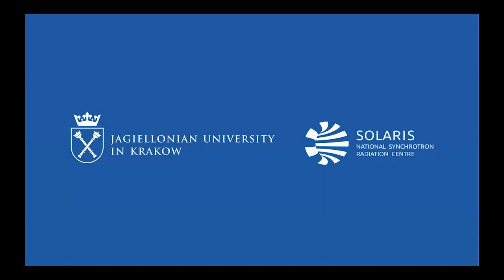So I divided this talk into two main parts. In the first part, I would like to present you the workings of our IGOR procedure, and I think it is a very powerful tool which could be used during your experiment.